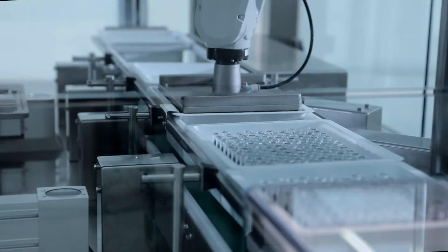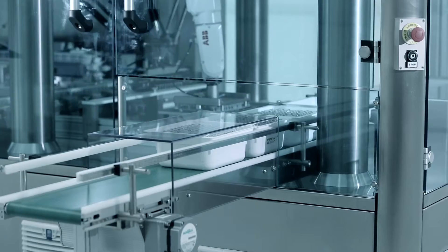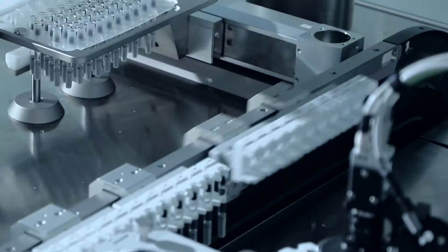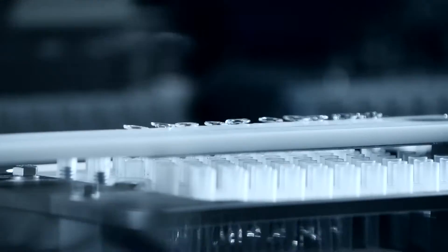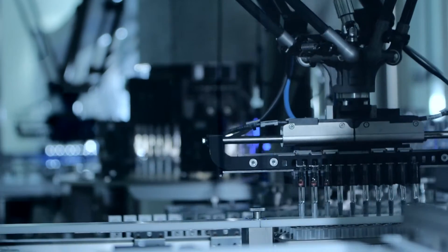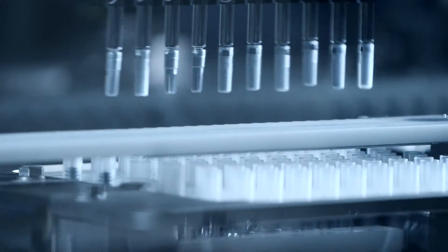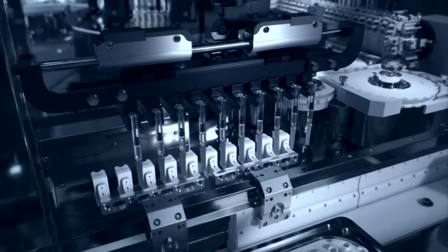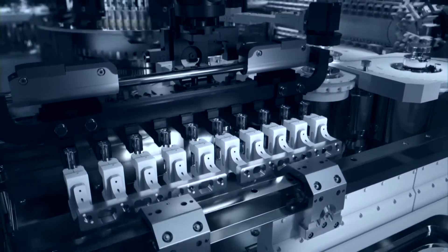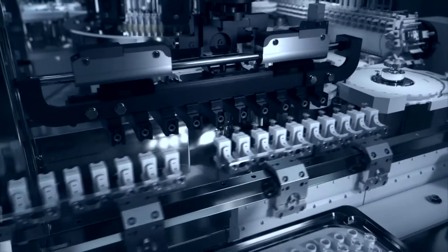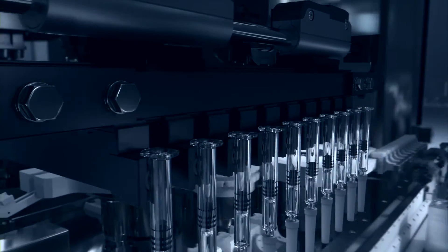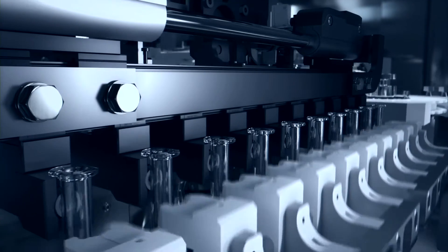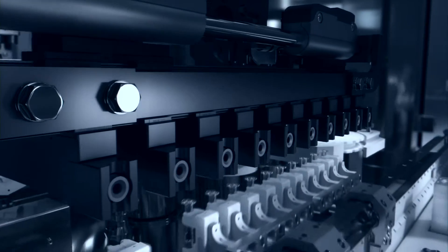The K15DR integrated inspection solution flawlessly provides for a fully automatic carbon nest cycle. Denesting, inspection and re-nesting activities are now performed by a single compact and reliable machine. Two robot arms are provided for the de-nesting and re-nesting activities, while linear motors are used to gently transfer syringes into the infeed and outfeed star wheels of the inspection module.